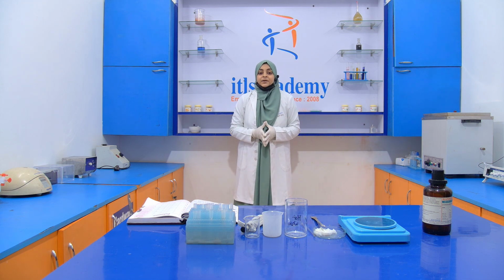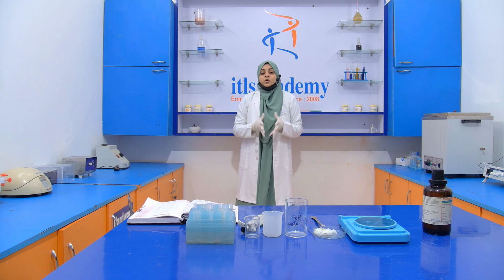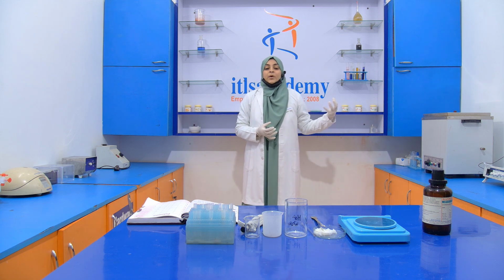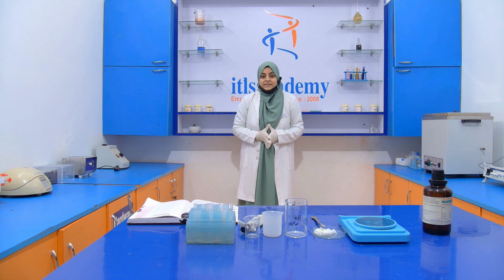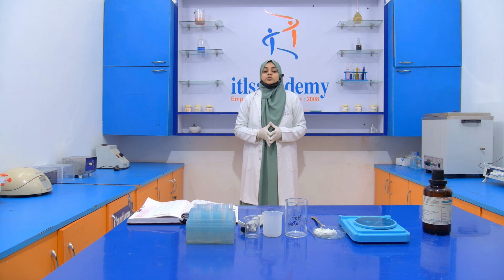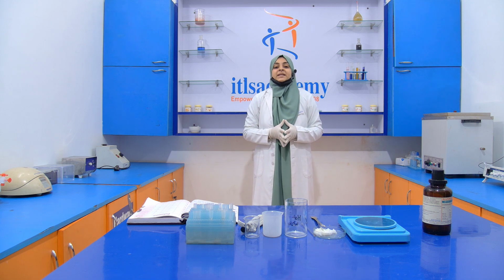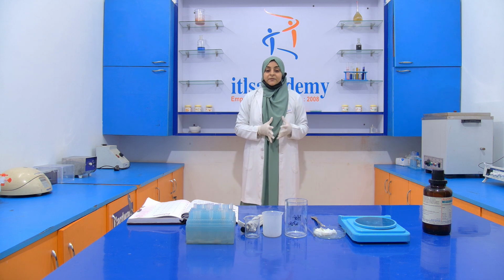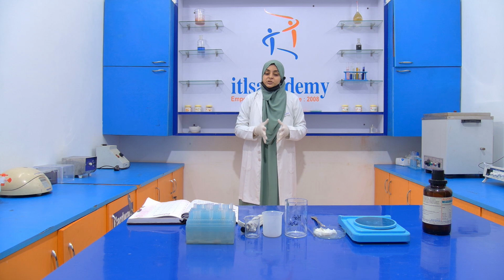This adulterant is added into the chena or rabri so that the quantity of the product increases. But when this adulteration occurs, the quality of the product decreases, and even the nutritive value of the product also decreases. So the reason behind performing this experiment is only to detect that blotting paper, otherwise it will affect the quality of the rabri or chena.